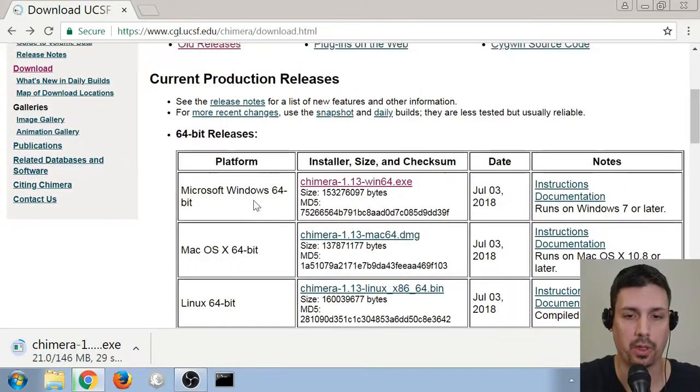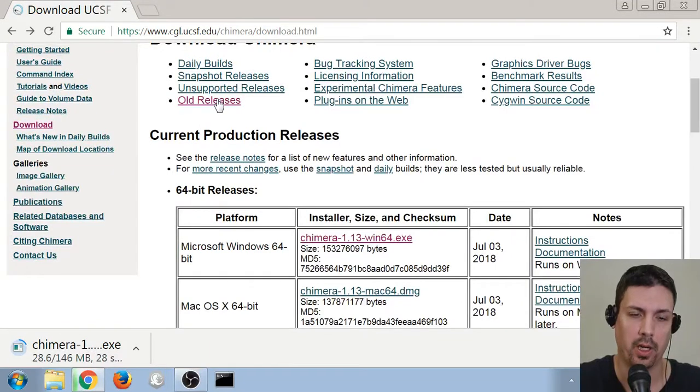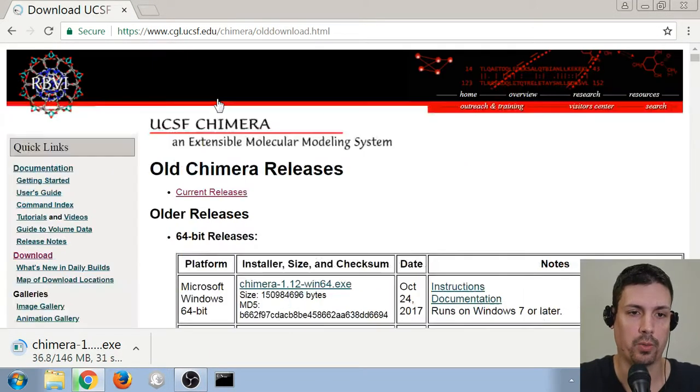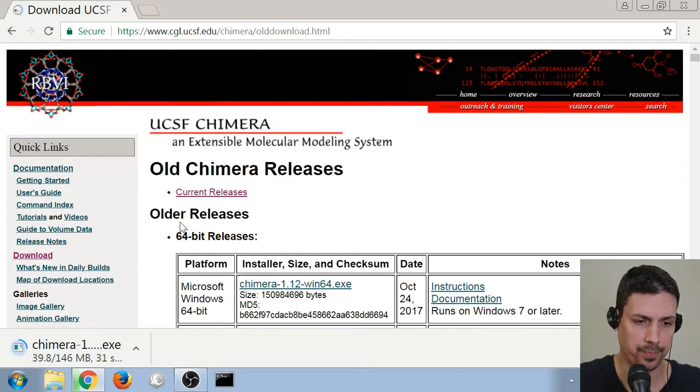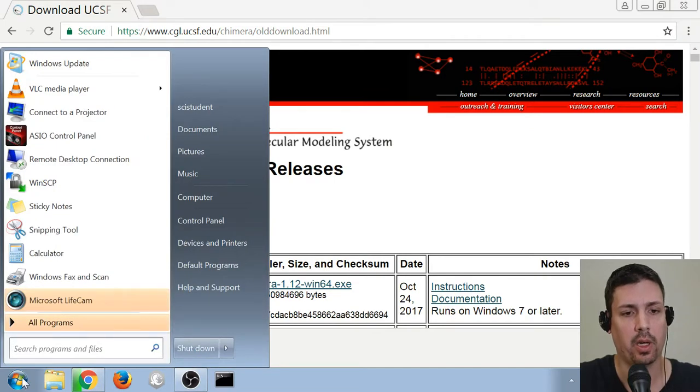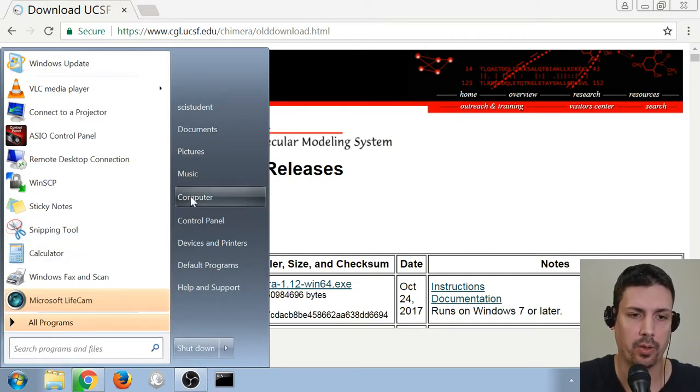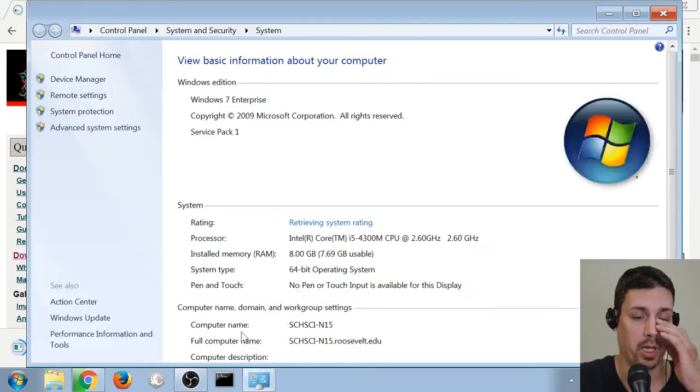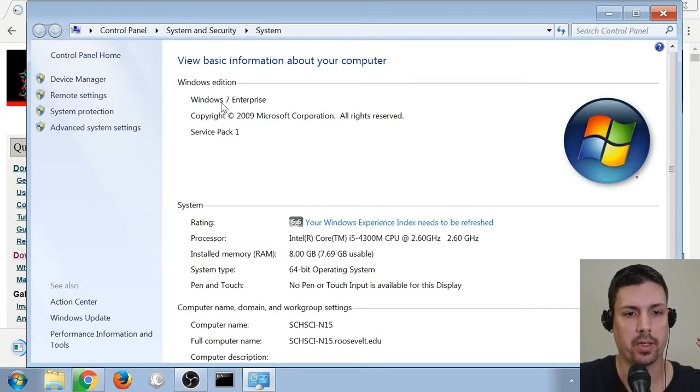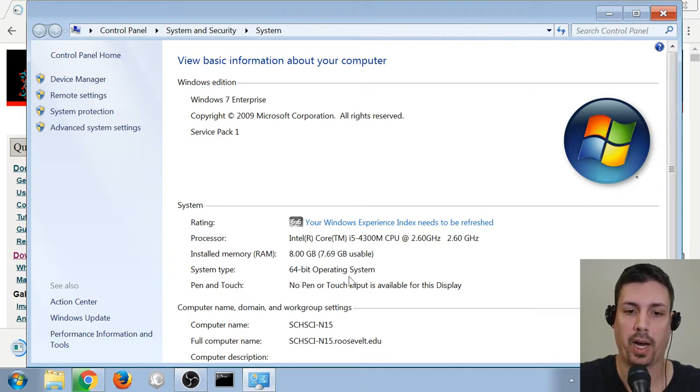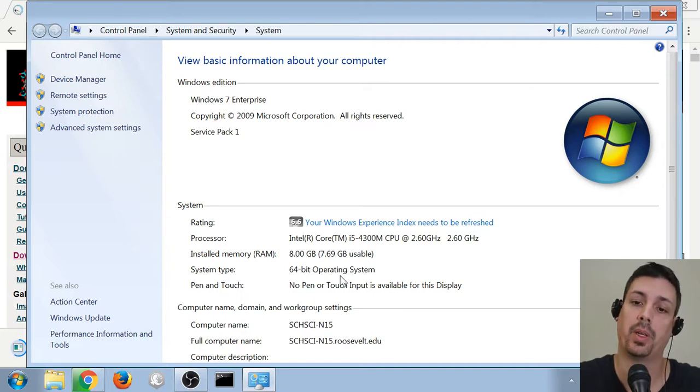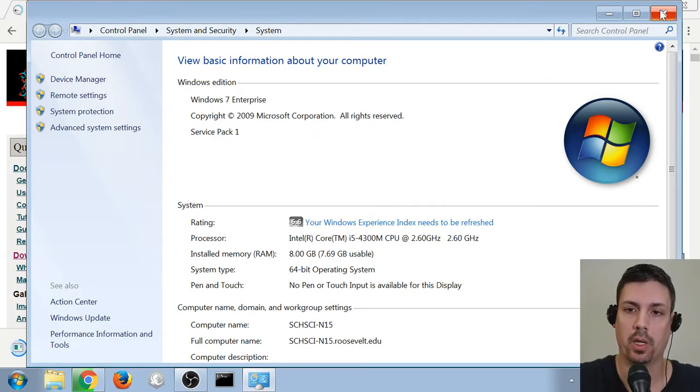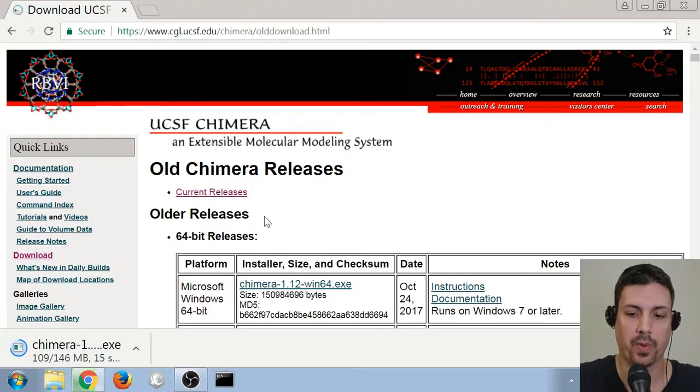For those people running older computers, Windows XP, Windows Vista, 32-bit machines, you're going to need to go to old releases here. If you're not sure what version of a computer you have, the easiest way I've found is to click on the start menu, right click on computer, and then show properties. And you can see here it shows me that I'm running Windows 7, and under system type it shows 64-bit operating system. So that means I can use the main one. But if it says 32-bit operating system or an older version of Windows, you'll need to scroll to the old release page here.